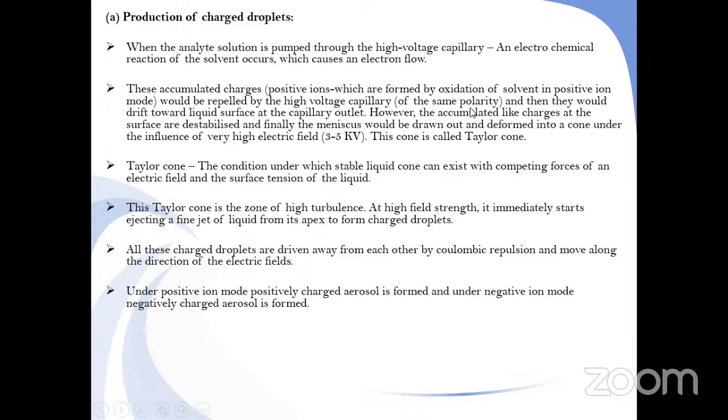in the LCMS method. The other method is atmospheric pressure chemical ionization, which we can call the APCI method. Its primary application is in the ionization of low mass compounds. Generally, low mass compounds are applied to this atmospheric pressure chemical ionization method, that is, low and moderate polarity compounds.